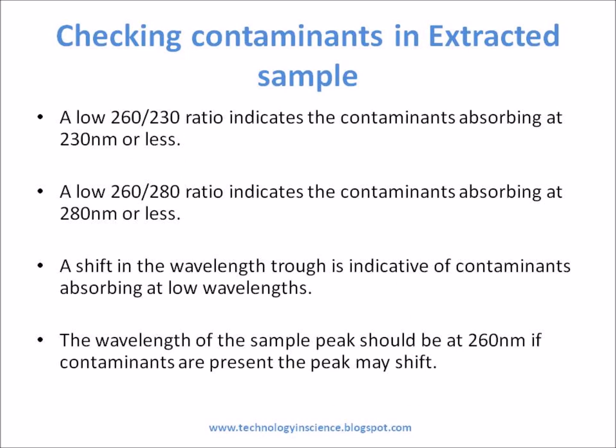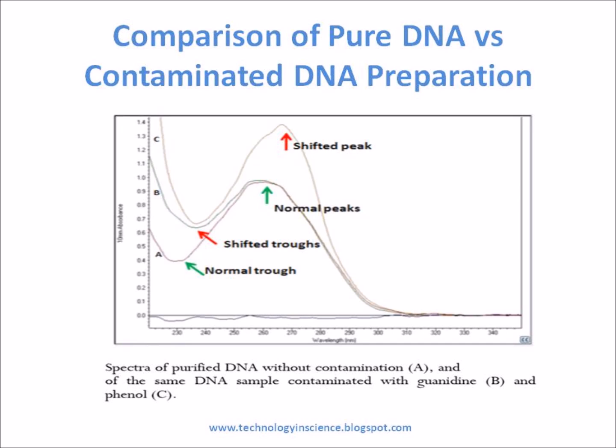A low 260/230 ratio indicates contaminants absorbing at 230 nm or less. A low 260/280 ratio indicates contaminants absorbing at 280 nm or less. A shift in the wavelength trough is indicative of contaminants absorbing at low wavelengths — the sample peak should be at 260 nm, but if contaminants are present the peak may shift. If the sample is contaminated with proteins or other organic compounds, the 260/280 ratio will vary from the expected values.